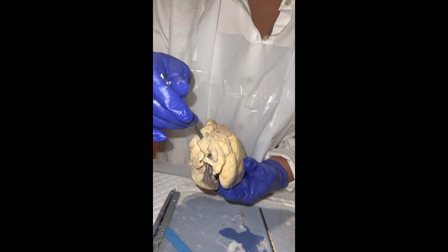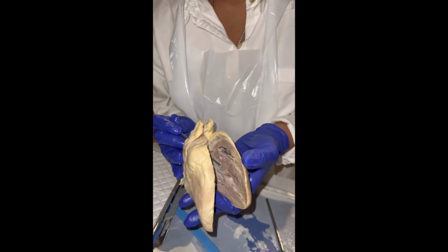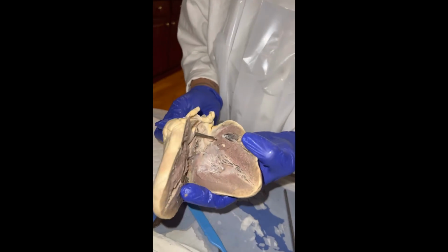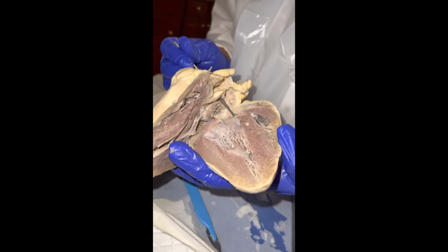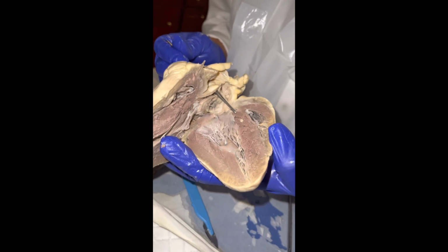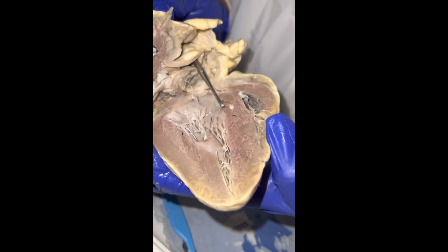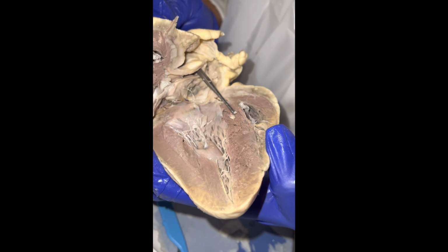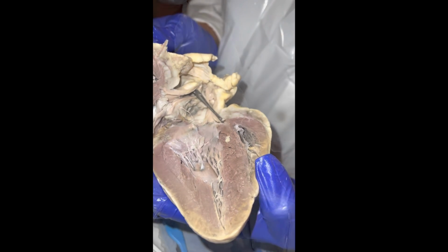Now, using my instrument to kind of poke through this region here, I'm able to easily locate the tricuspid valve, which is just right along this region here. And then once again, this is the papillary muscle. Very easy to locate the tricuspid valve in this case.